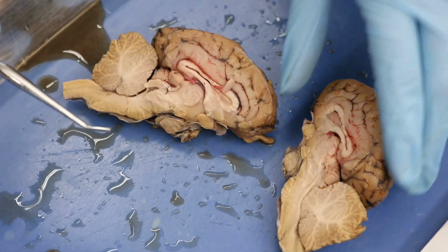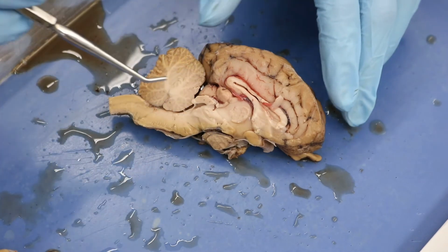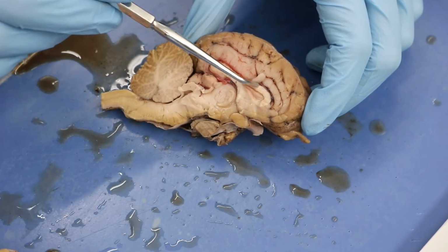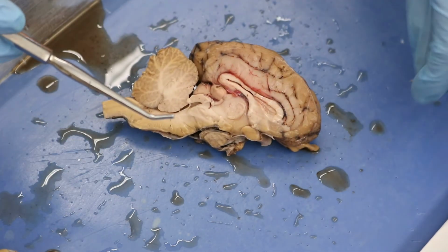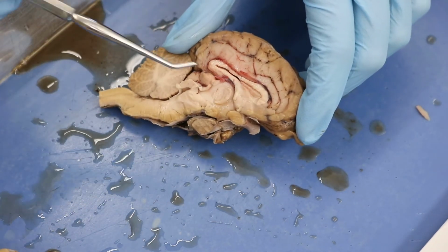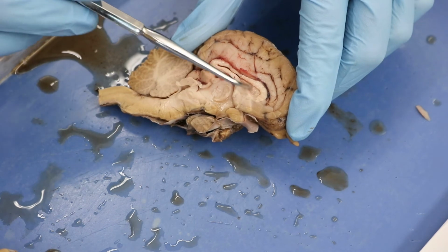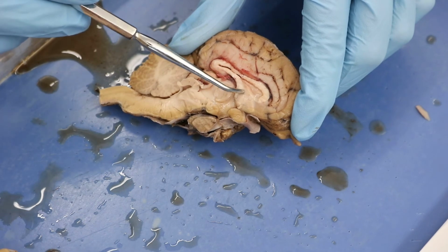All right, guys, so we're going to go ahead and put this piece aside, and we are going to focus in on the inner portion here. So we still have our frontal lobe, parietal lobe, occipital lobe here. We also can see that we have our corpus callosum up top here. We have a little extra piece of tissue that we'll just go on ahead and get out there. So that's our corpus callosum at the top. Now, directly underneath that, you see that there's kind of a glistening thing here. This is septum pellucidum. So septum pellucidum, and underneath that is the fornix, okay?